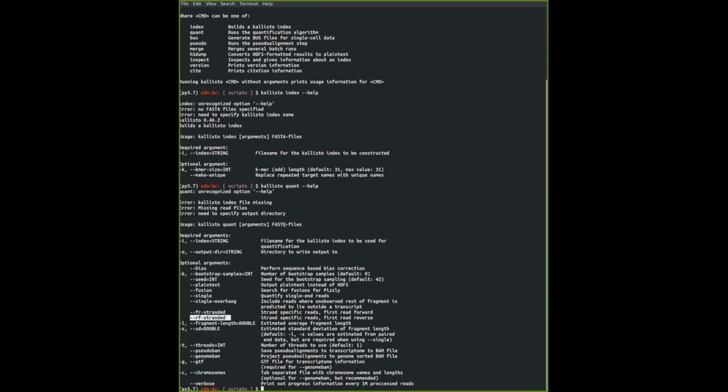If you're using other platforms, or you just want to check your strandedness, you can do a very simple BLAST search on your sequence. Just take a few of your read pairs, maybe the first 3, and BLAST, or in UCSC do BLAT. You can get an idea of which orientation comes first. Is it the reverse read that comes first, or the forward read? You typically don't have to do this, because by default RF stranded will be the default.